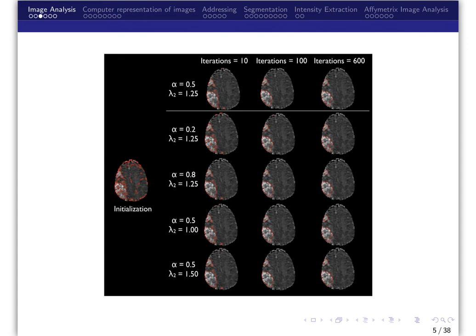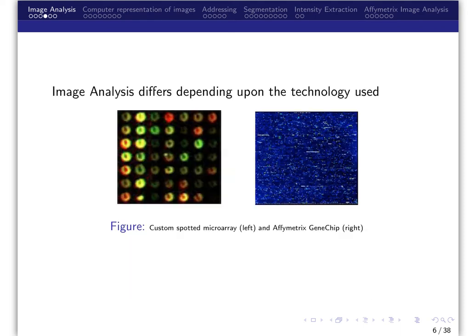In biology, image analysis includes magnetic resonance imaging, or MRI scans, outlining and measuring objects like stroke lesions in a brain image, as shown here, or when assessing structural deformations of the heart, assessing degeneration of retina, etc. We will focus on image analysis techniques as applicable for microarrays.